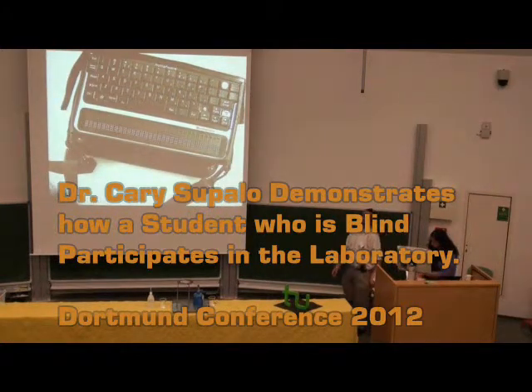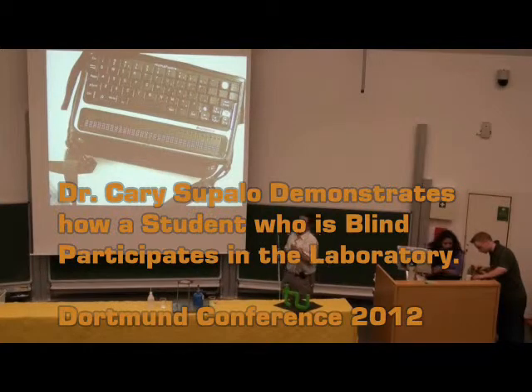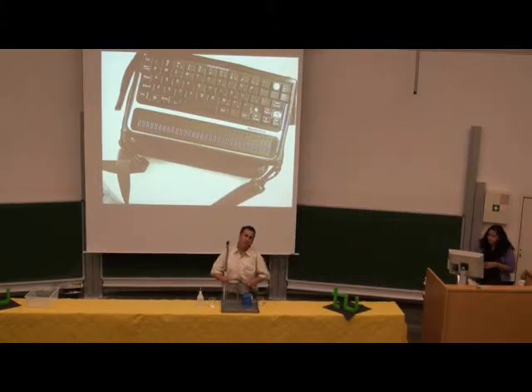So everyone always asks me, how do you do lab work? I prepared a little demo for you guys on the bench top here.